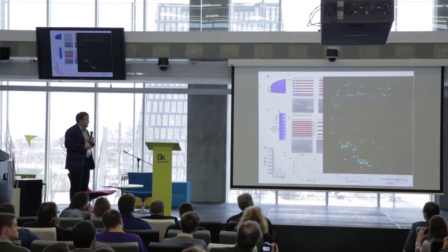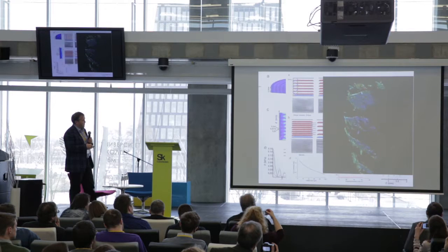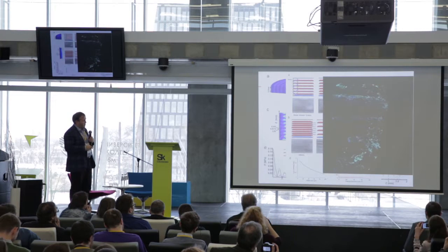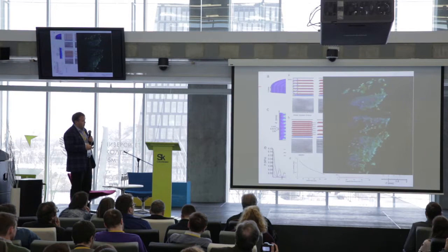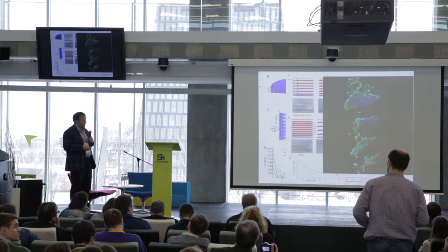We have taken these embryonic stem cells and then assembled them here in 1, 2, 3, 4, 5 layers. And the construct kind of bends afterwards, and you can take these confocals. But the idea is you are pretty much generating almost a single layer of progenitor cells that you can then control the height between each layer.